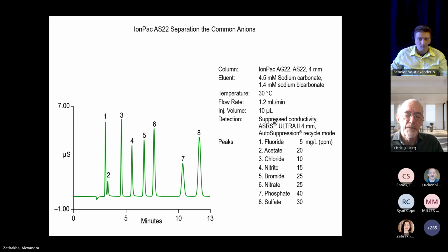In the early 2000s, because we needed a pH stable phase that would get good resolution of bromate from chloride with a hydroxide eluent, we developed a technology called electrostatic attached hyperbranched condensation polymers, where we're using the same wide pore substrate I described for the CS12A, but here we're making a hyperbranched film that has no aromatic structure whatsoever.